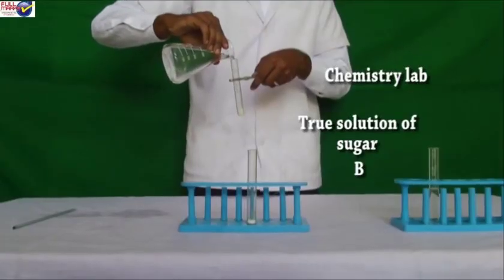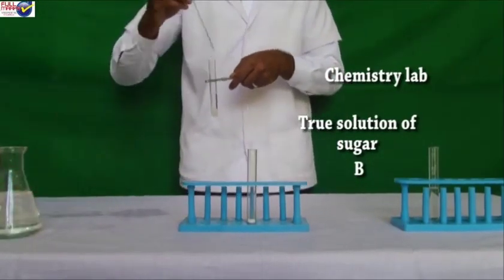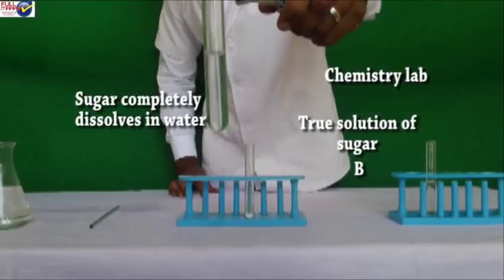True solution of sugar. Take a clean, dry test tube and add 2 to 5 ml of distilled water in it. Pour few sugar crystals in it and stir the content with a glass rod. The sugar dissolves in water to form a true solution.